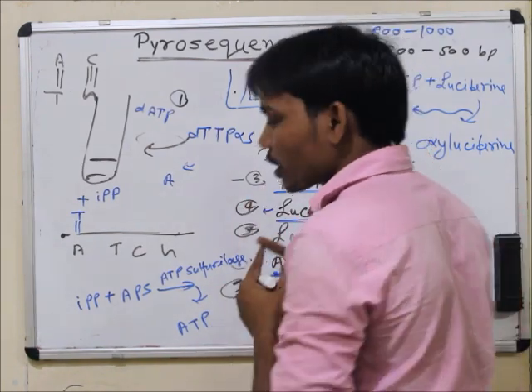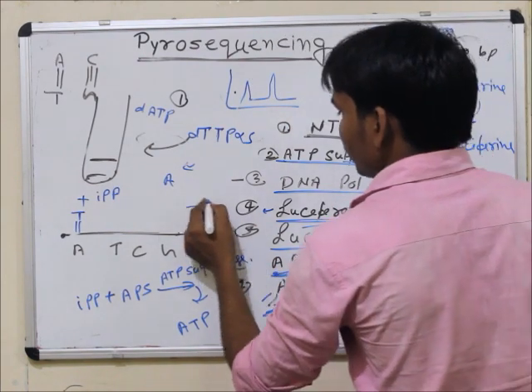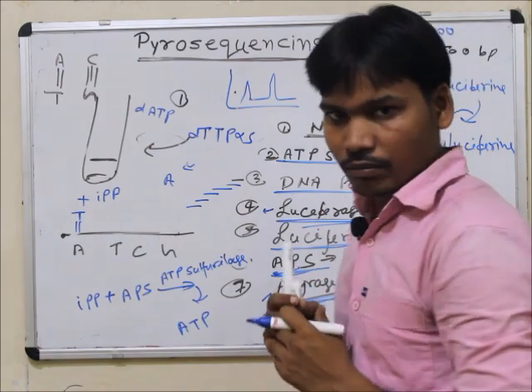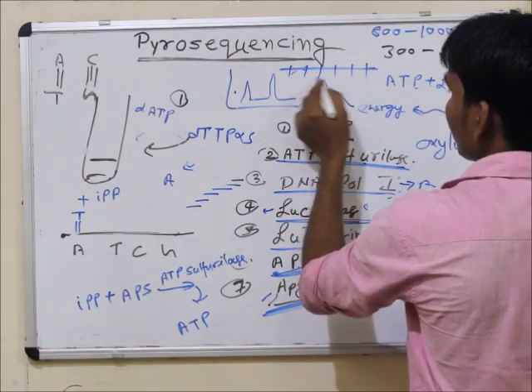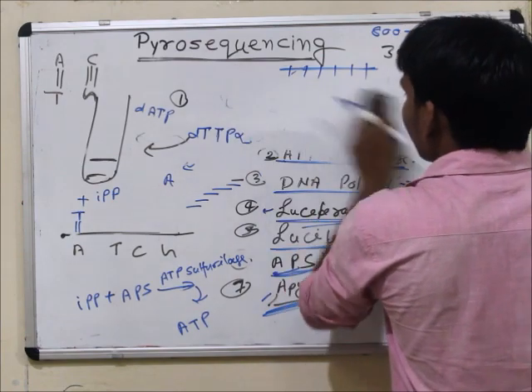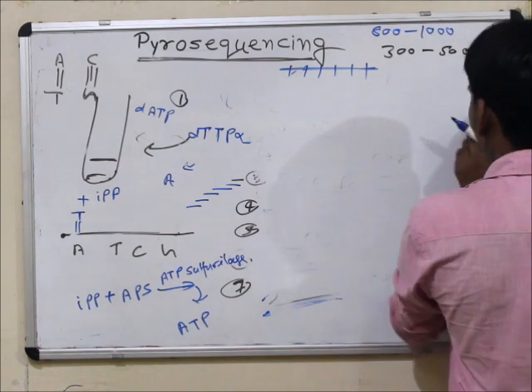This is another part of the lecture, how contigs are formed. Arrangement of the contigs will be another reaction, the formation of contigs. You know that for a long sequence, restriction enzymes are required to cut the DNA, and all the pieces would be sequenced by pyrosequencing.